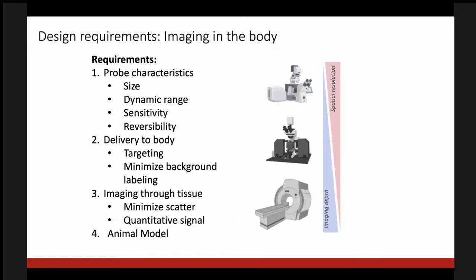Sensitivity is also very important and I think overlooked sometimes. And so quite often in the area of diagnostics, when we're thinking about, let's say, COVID diagnostics or some sort of diagnostics, people quite often say it's like looking for a needle in a haystack, right? You want to look for a very small number in a sample. But really here, in our particular application, we're not looking for a needle in the haystack. Instead, we're looking to be able to measure a certain amount of change in our biomarker on a background of that biomarker. And so I like to refer to it as measuring the addition or subtraction of a few pieces of hay to that haystack, right? We need to make a very sensitive measurement on a very high background. And it's a very challenging problem.